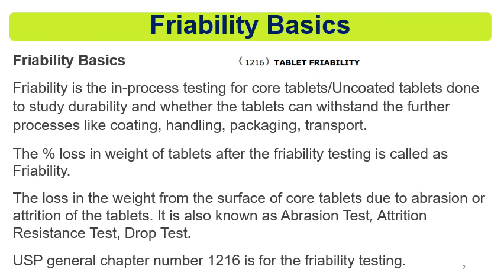Many times, whenever the tablets are removed from the blister, the tablets break, and that happens because of the friability. The percent loss in the weight of tablets after the friability testing is called friability. And friability means once you perform the testing, you check the percentage loss in weight compared to the initial weight, that means before testing and after finishing the test.